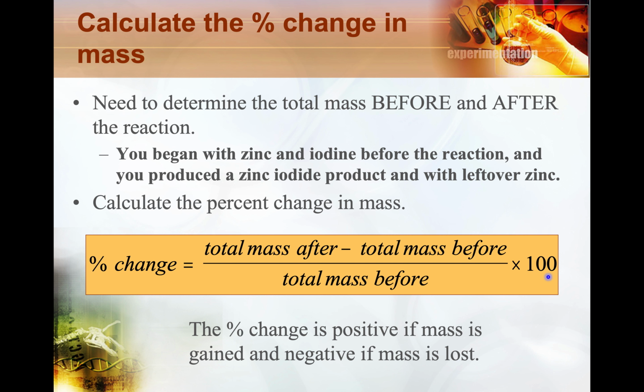Consider the different ways that you've introduced error. You can consider if you did not completely move anything over, if you didn't remove all the methanol, if you accidentally spilled something. Consider all the different ways that you may have misrepresented the mass that then changed to an addition or loss of mass over this whole reaction.